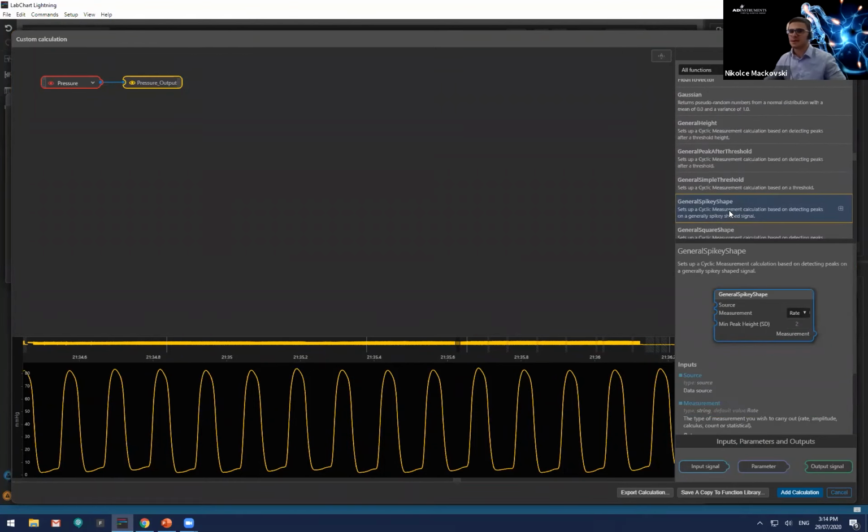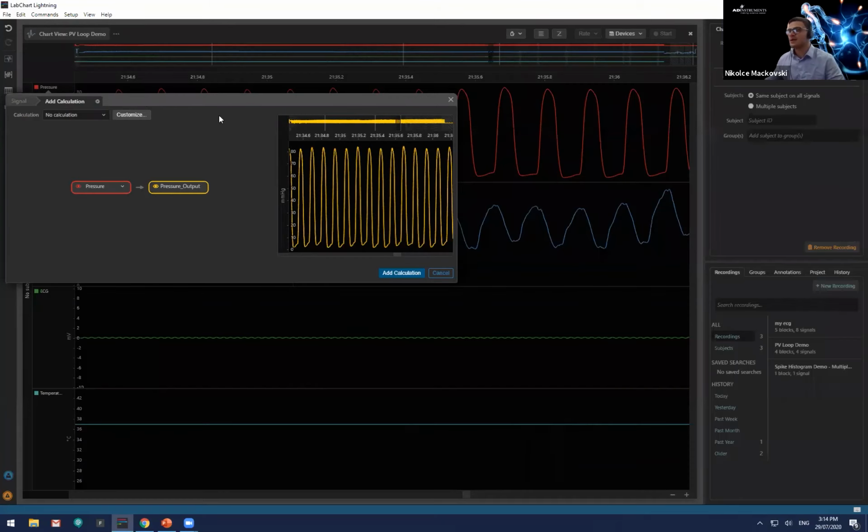So you can use these, of course, if you're looking at blood pressure, possibly some work within spirometry, you can use it in EEG, of course, some neurophysiology is possible. But otherwise, if you have any questions, please ask me, and we can just go through these together.